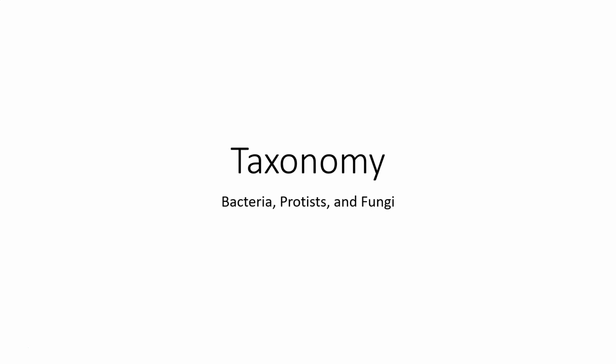Now, another thing that can really help you out as we go through here, let me find the right page. There is a table that starts on page 288 in the lab manual. It's number 7. It's one of those post-lab questions, but filling in this table can really do a lot to help you understand the organization and the taxa that are occurring with each of the different specimens that we're going to be going over. So I'm going to recommend that you fill this table in as we're doing the slides and learning the information, and I'll tell you if you have to flip to other pages to fill in some other stuff, but put a little post-it note or something on page 288 so that you can keep flipping back to that table and fill that table in as we go.